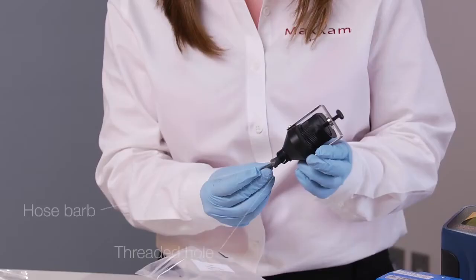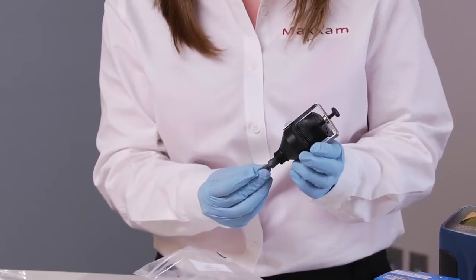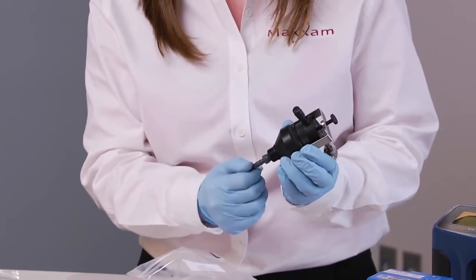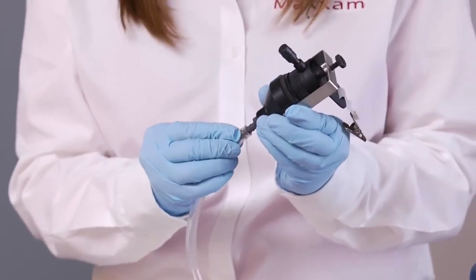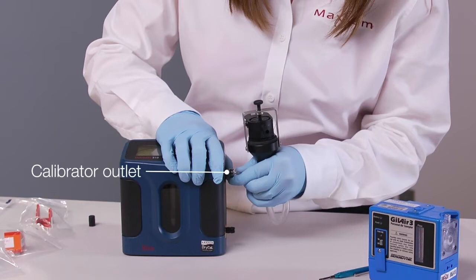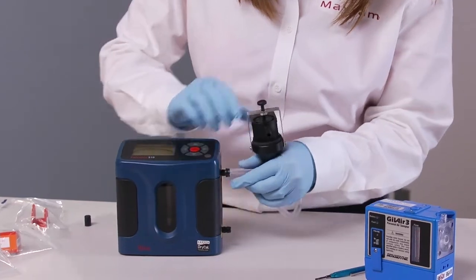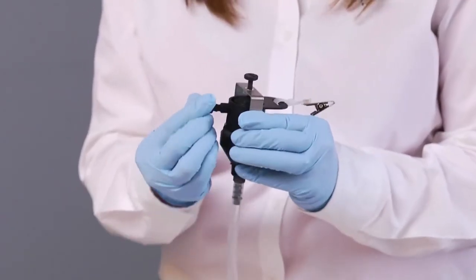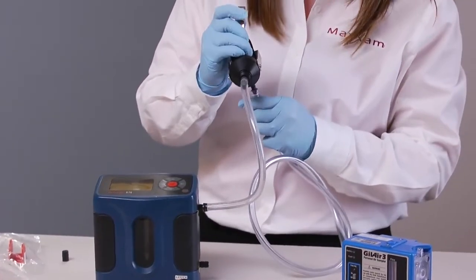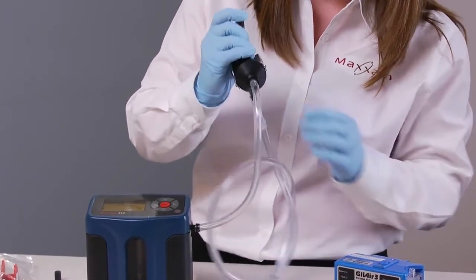Next, screw the hose barb into the threaded hole on the adapter and connect the barb to the calibrator outlet with a piece of flexible tubing. Remove the dust cap from the sampler outlet. Connect the sampler outlet to the sampling pump and calibrator.